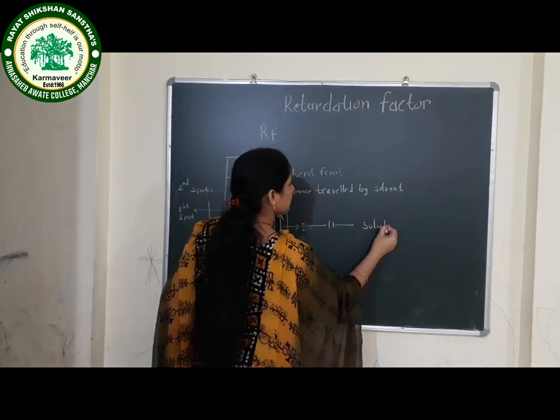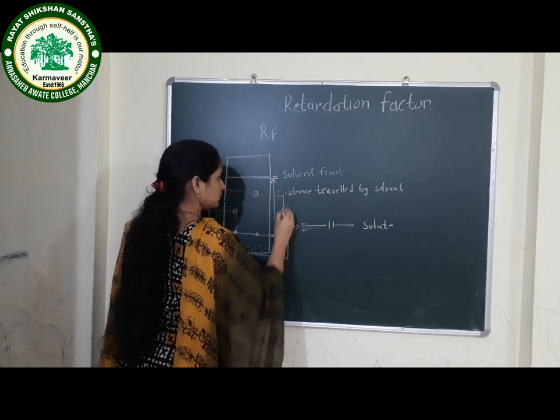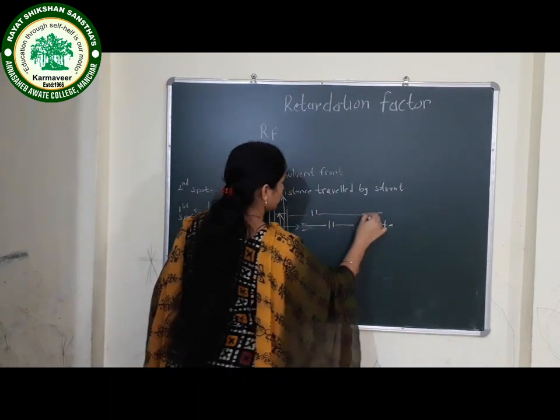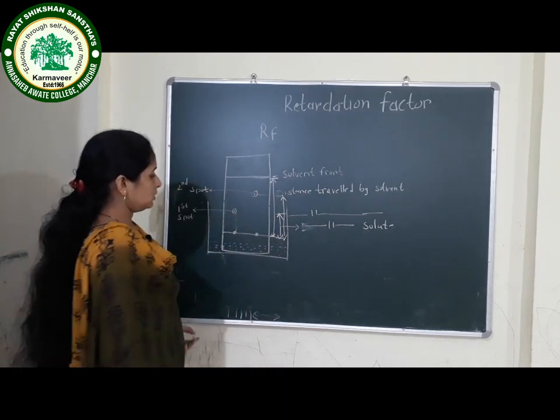This one is also distance traveled by solute. Okay, this is the distance traveled by the first spot, and this is the distance traveled by the second spot.